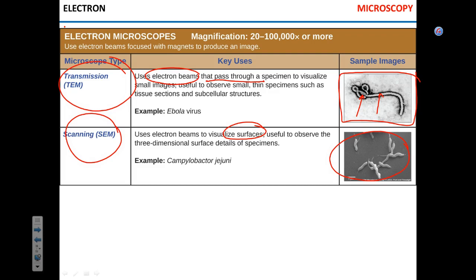So what basically happens in cryo-electron microscopy, you can take a sample and cool it down, really cool it down. I'm not sure that it's liquid helium, but for sure liquid nitrogen. And then you use electron microscopy technique to look at the object. But the resolution, so this is an individual cell, right? Right there.